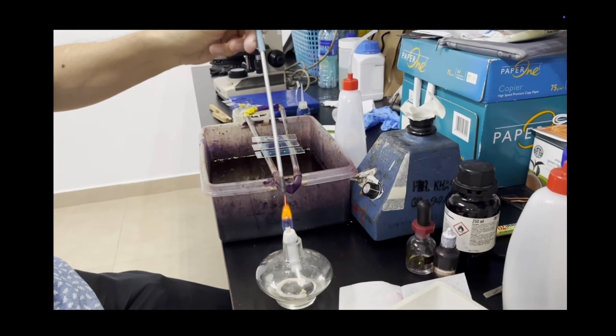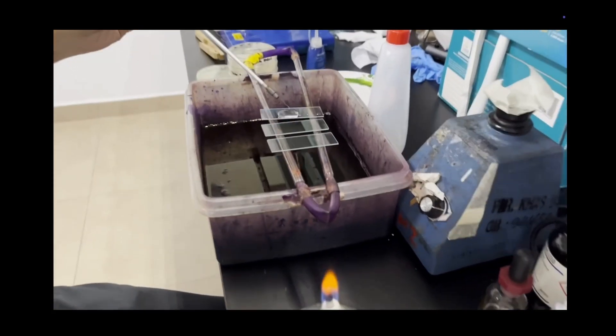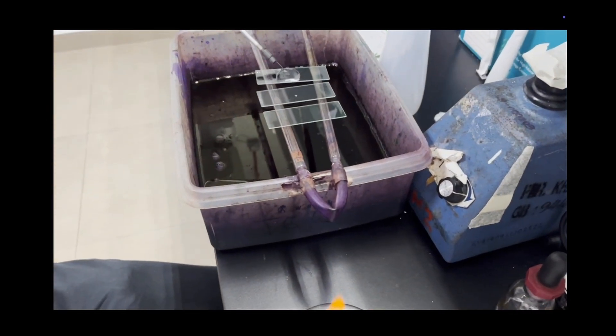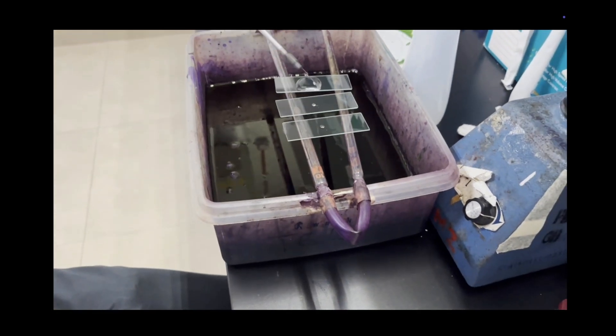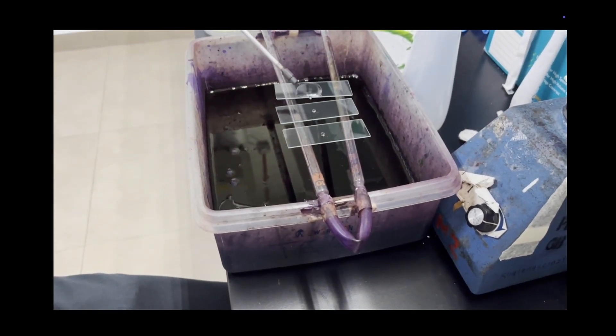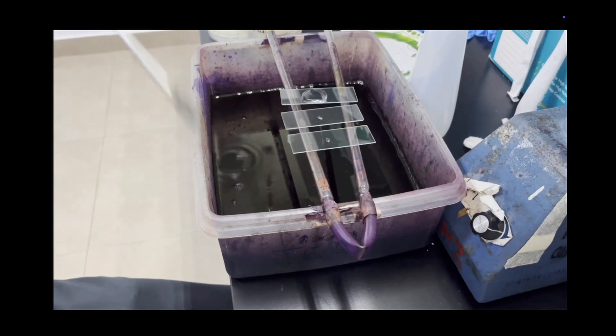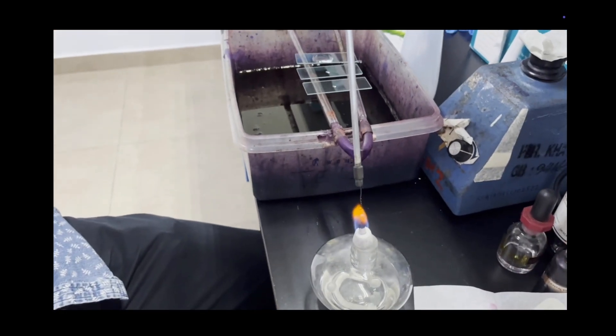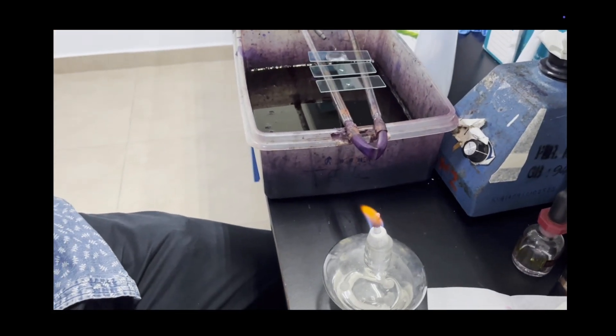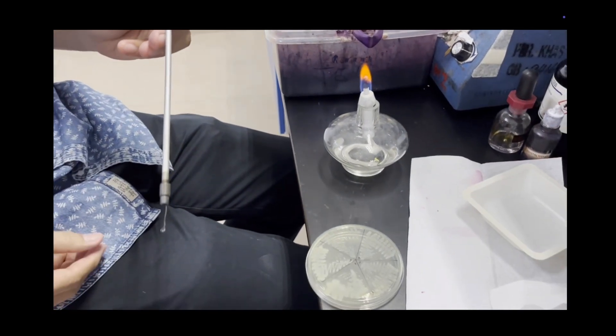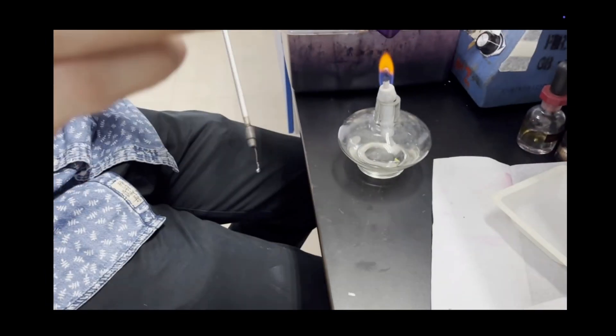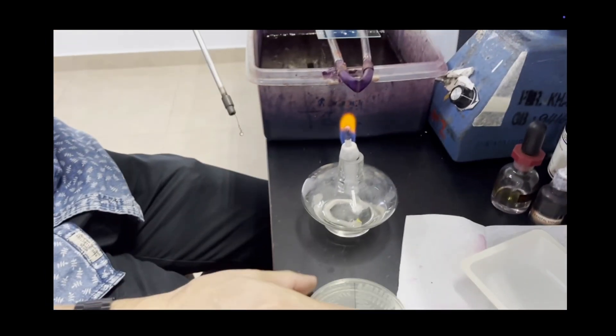For this flagellar staining we'll be using the Ryu stain method. First we place some sterile water onto clean fresh slides, and then we can use a loop with a bit of water in it.